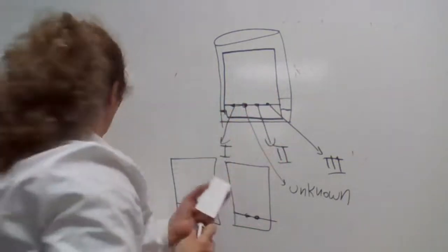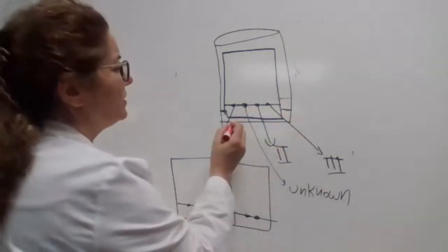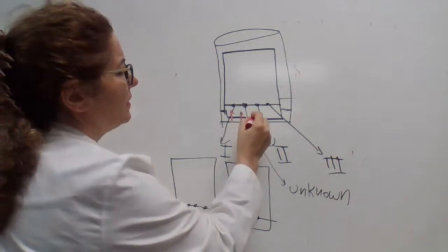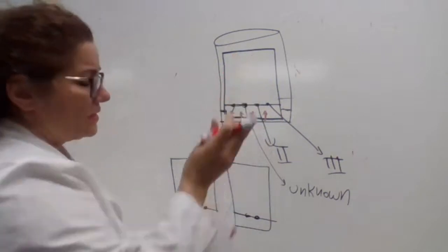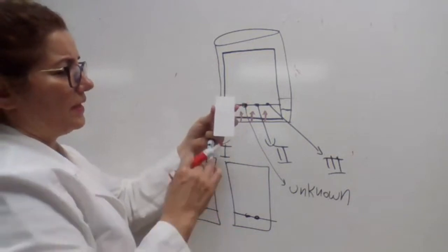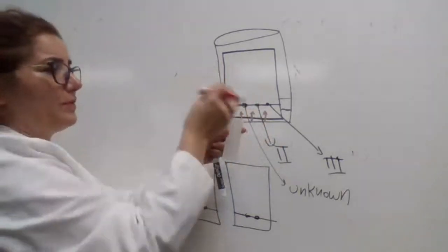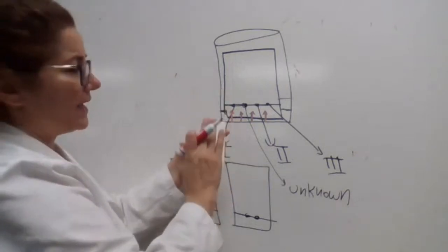So what's going to happen after you place that in the developing chamber, based on capillary action, the solvent is going to move up on the plate. The solvent moves up slowly, and if you leave it in the developing solvent and don't watch it, it can actually go to the top and go down the other side. It continuously goes up by capillary action.